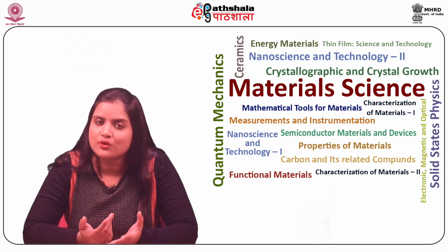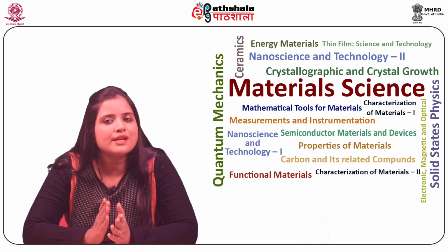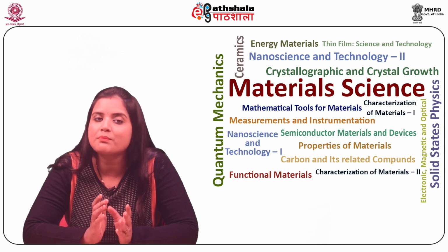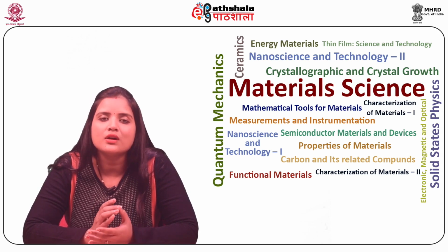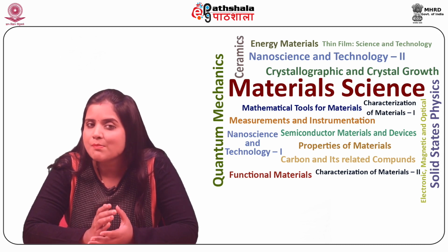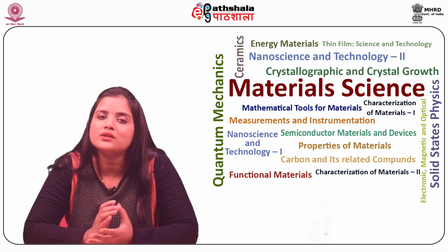The field of holography is most certainly mature. It is now over 60 years since Dennis Gabor's Nobel Prize winning invention of a new microscopic principle. The term hologram has since entered the vernacular, and classical, that is, film-based holography has been used in myriad applications over the decades.